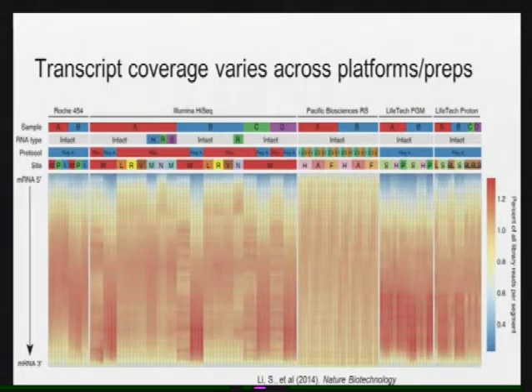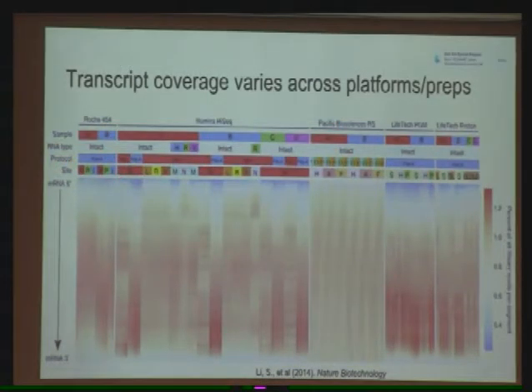Yeah, so this is part of the experimental design. This is just the number of times that they replicated that experiment. With Roche, the reason we have so few columns here compared to Illumina is just because there were fewer sites that did this experiment. They designed it so that they had one RNA type, one protocol, and then 3 sites each ran the samples.